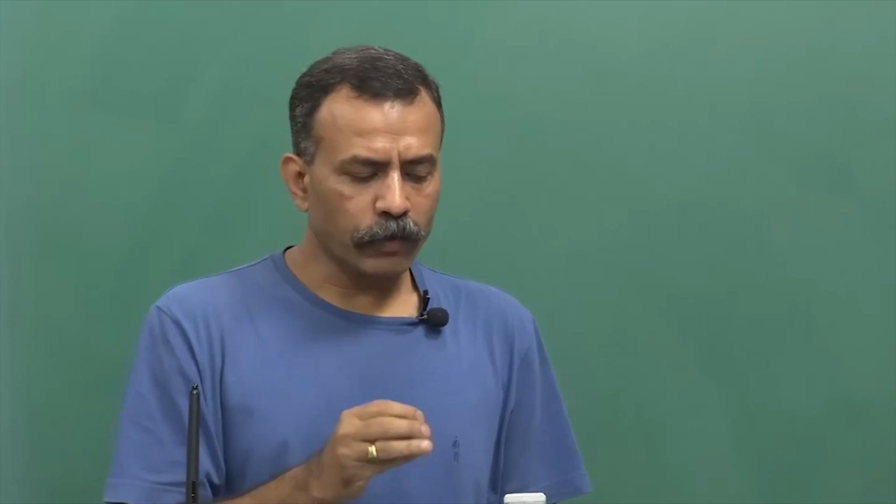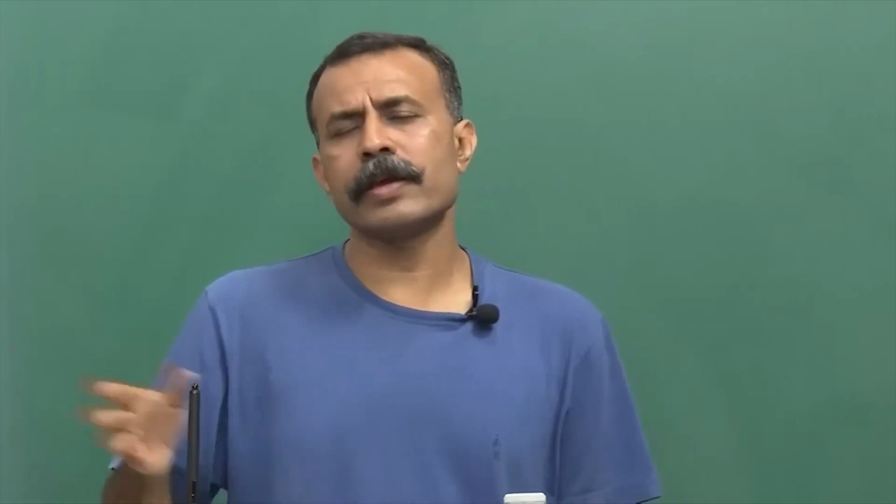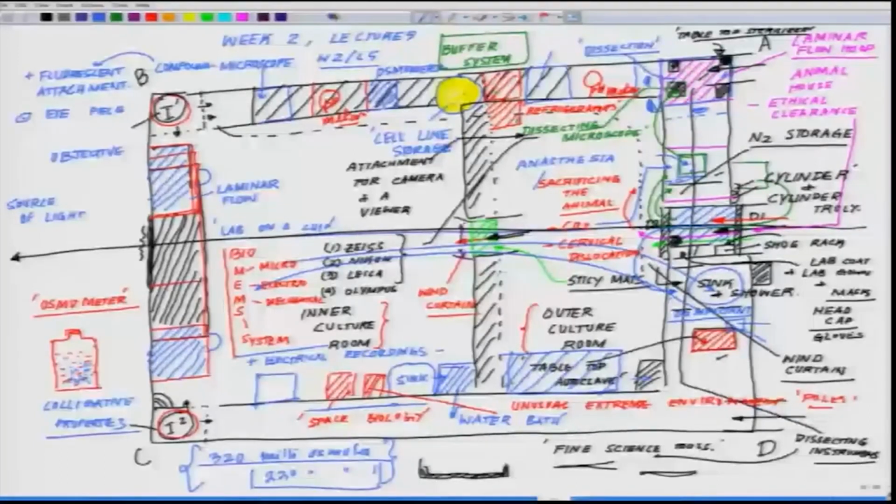So you see, as of now we have discussed some of the specific areas. This area may go a long way. So I have only talked to you about, say, suppose you have a facility for working on space systems, space biology, or you are creating a system of extreme environment, so you have to have separate incubators, or you are working on something like microelectromechanical systems and electrical recordings. So you may love to have all these facilities in and around you, and these are the kind of things where these are helpful.